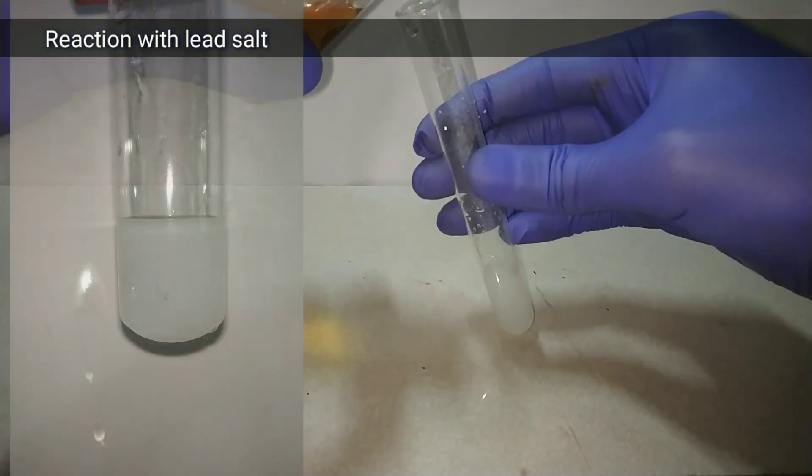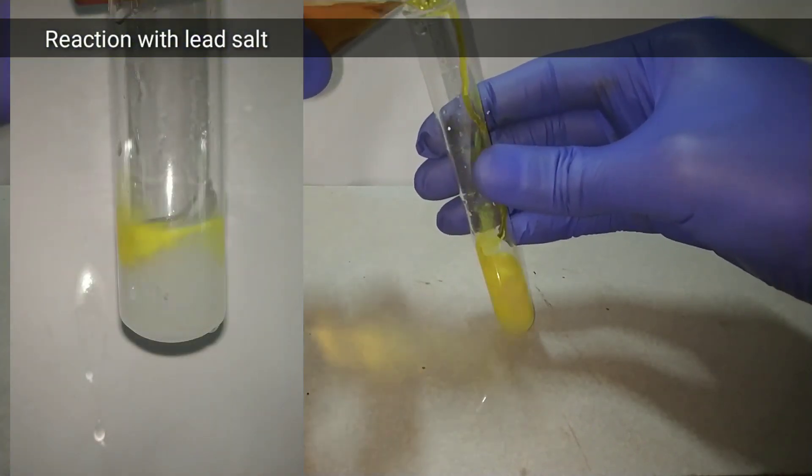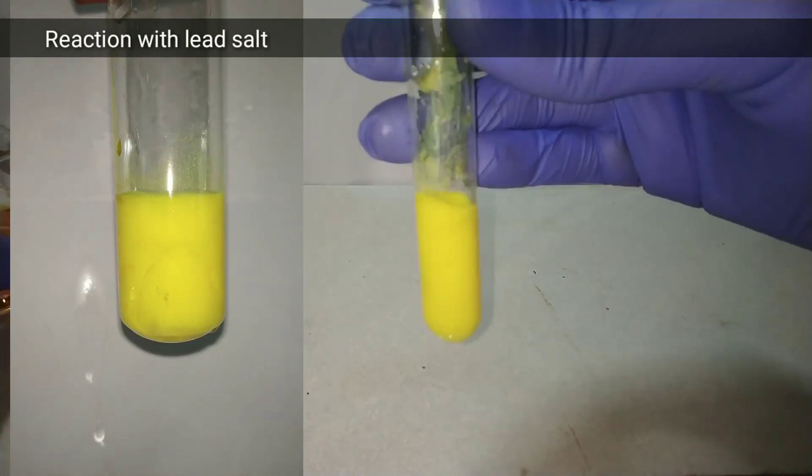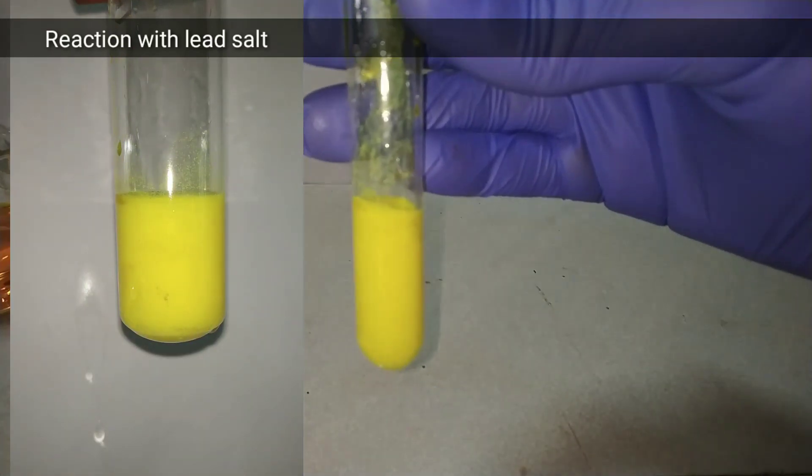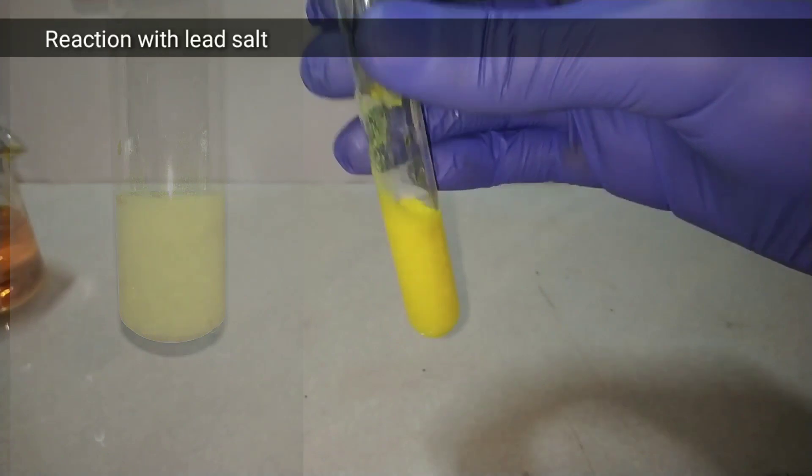Now let us see some precipitation reaction with lead salt. With lead salt it gives a yellow precipitate of lead chromate and this is used in the qualitative analysis of lead ions.